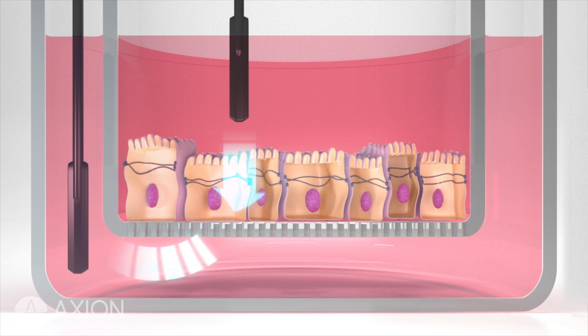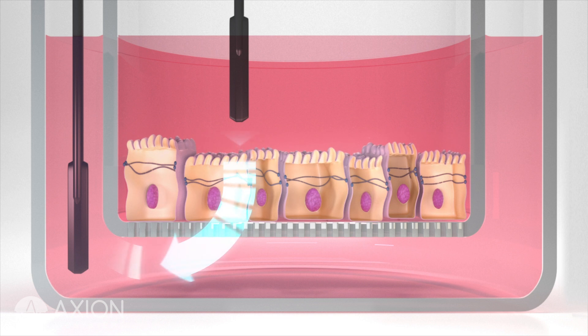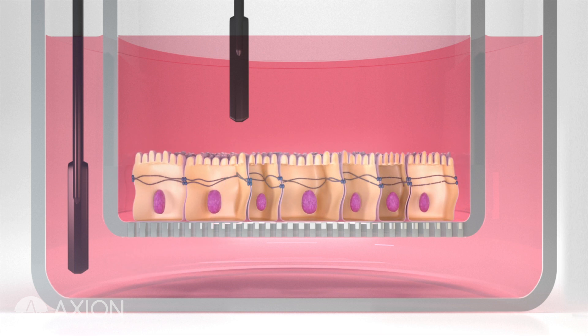This method is typically low throughput and variability can arise from electrode placement, changing environmental factors, and more. A fully confluent layer is required to accurately measure barrier function.